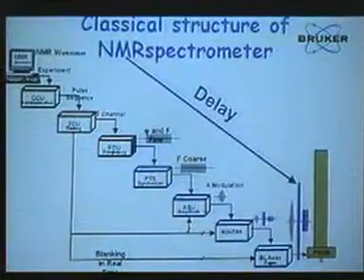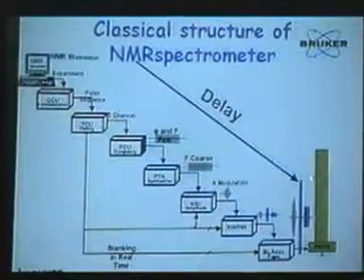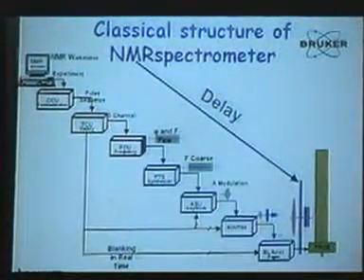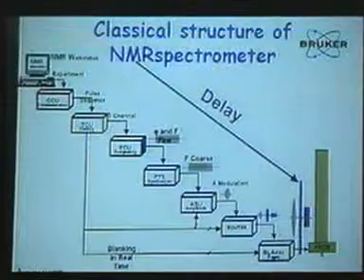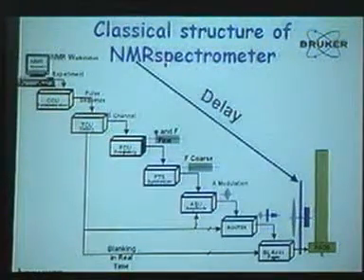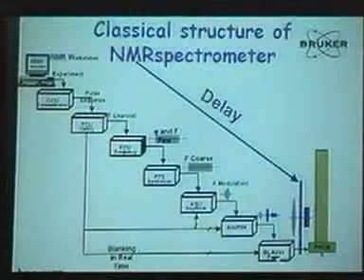So this is just a schematic representation of what was going on before. These are all the steps necessary to generate what I just described. You see that each of those steps, this is logical, each time you have a new step, you can introduce an error. So the fewer steps you have, the fewer errors you will have at the end, and the better this will be. Also, each step introduces a delay, and the more delays you have, the worse your sequence will be at the end.